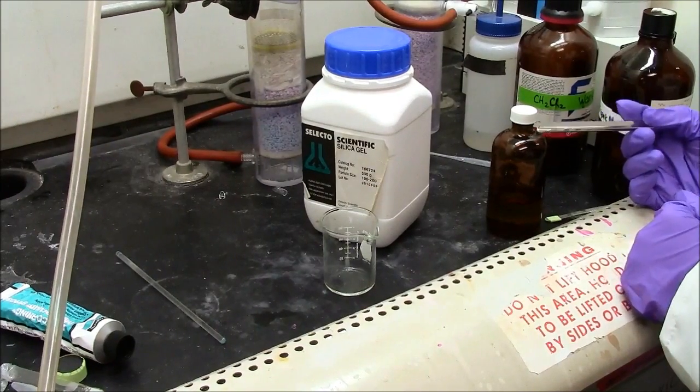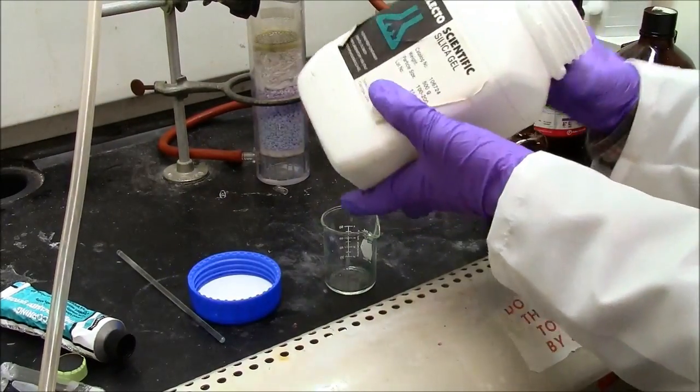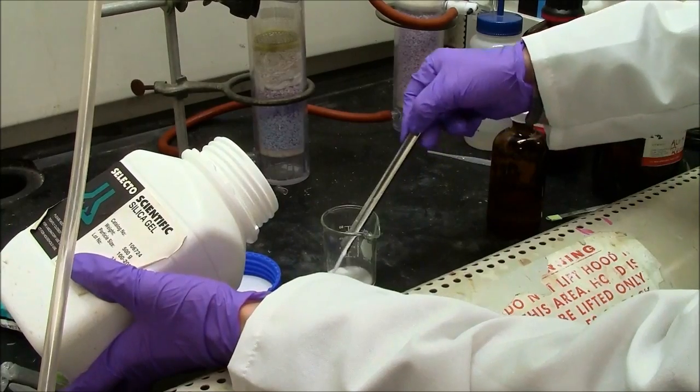We're going to add silica to the small beaker. We're estimating how much to use. The silica dust is very bad to breathe, so we're using this in the hood. Yeah, you can see very fine dust.